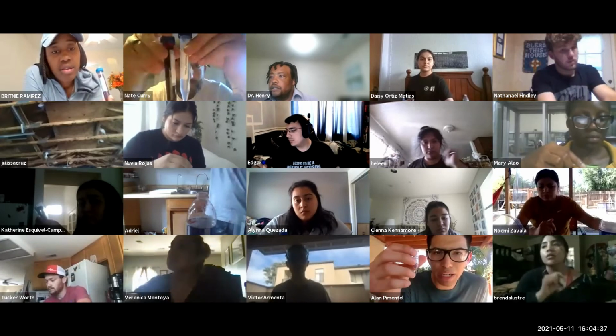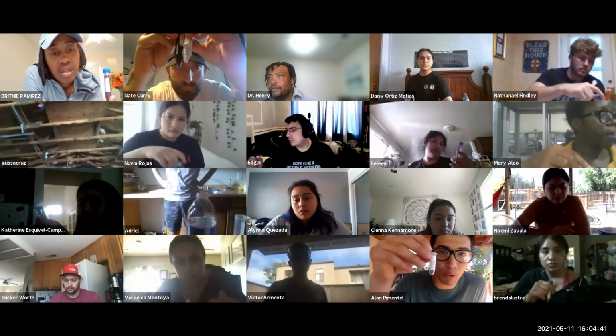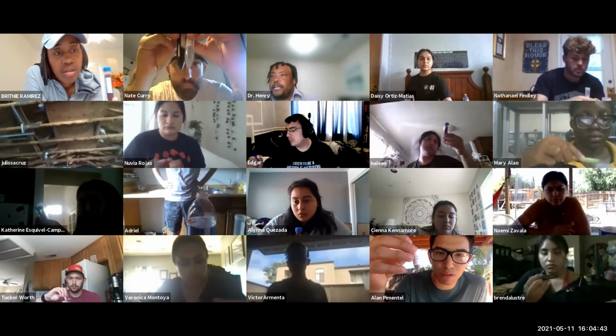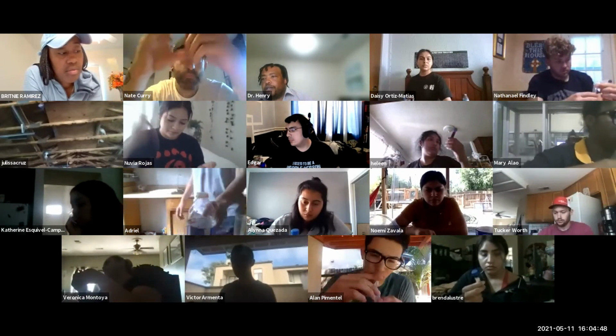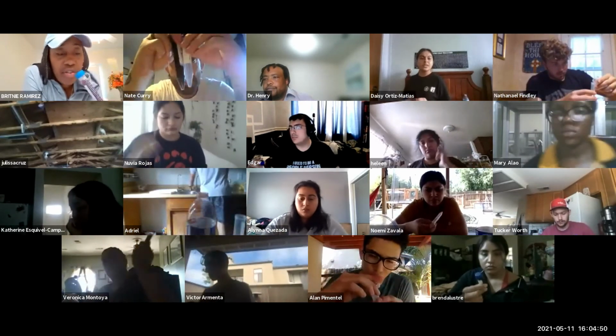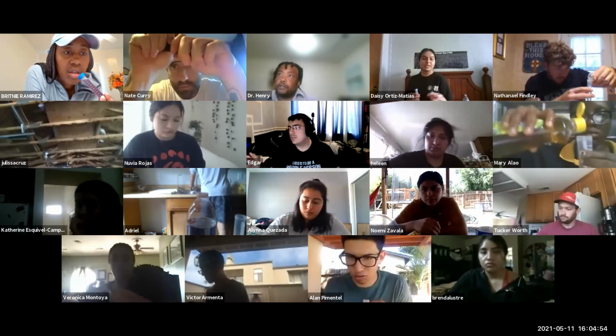How much do you have to add of this? Do we pour all of it in or just one? You pour it in. It should be roughly about what you need. So you want to make sure that you have enough room for it. Can you repeat the last part, Dr. Henry? I'm confused, like with the cabbage?